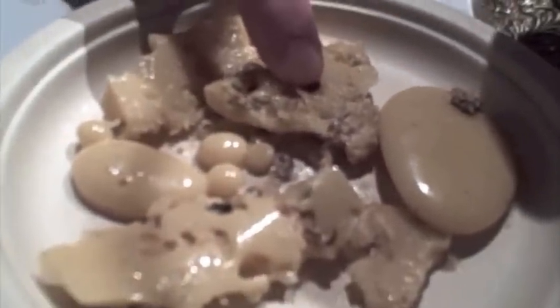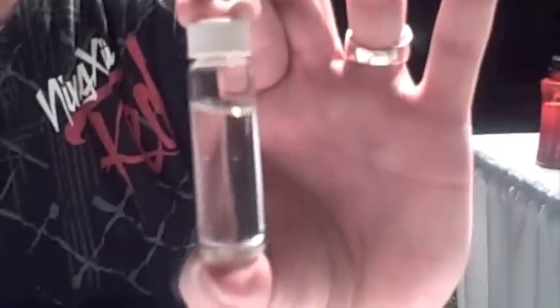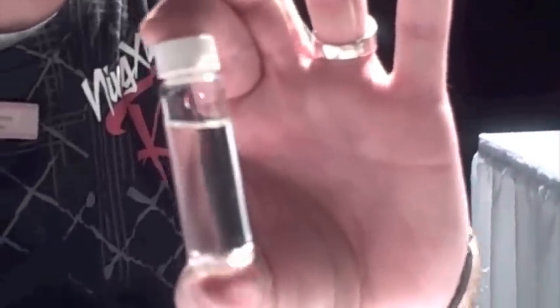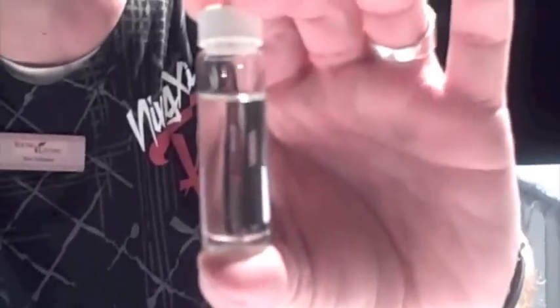And this over here is the resin after it has been distilled. This is a small vial of what we have distilled this morning in about an hour, a little over an hour and a half. So you can see there's quite a bit of oil that comes through there.